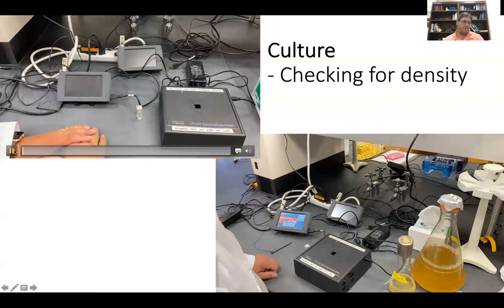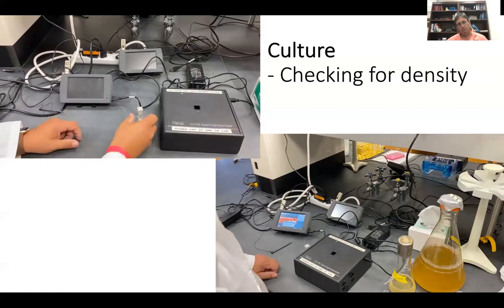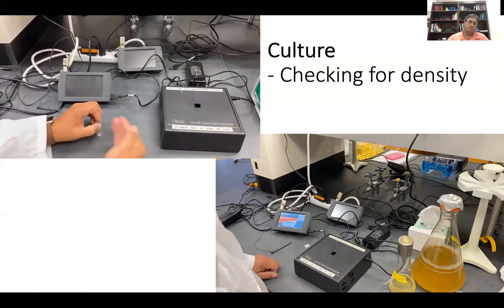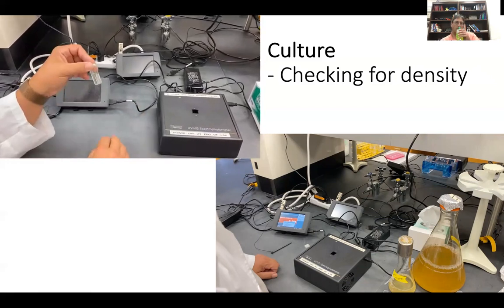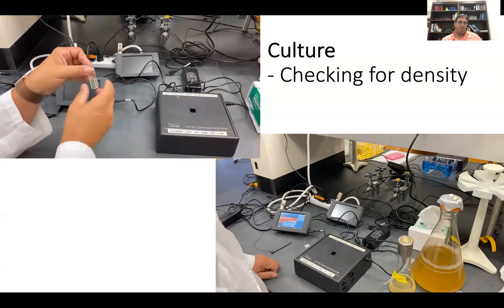All right, so depending upon your lab, you're going to want to be able to check the absorbance, or rather the optical density, how thick your culture is. We want to induce these early in the log phase. So we usually wait for and measure the optical density at 600 nanometers. Starting as a blank using LB with no culture growing in it.